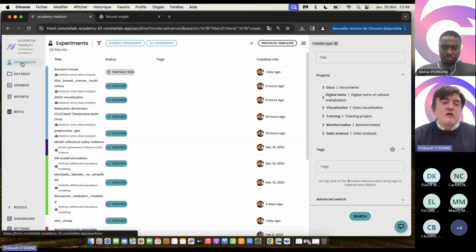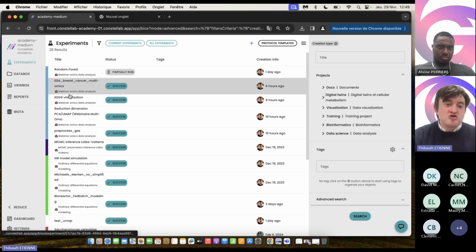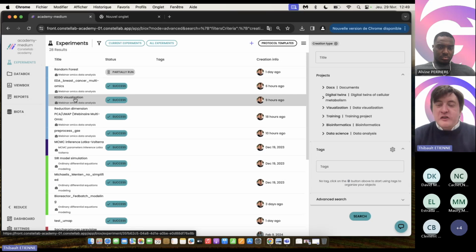And now what I want to do is explore the mechanism behind this subset I produced with the random forest algorithm. We can do a lot of things. Here, I focus on enrichment analysis, and I want to know if in this subset of genes, for example, I have some pathway enrichment.